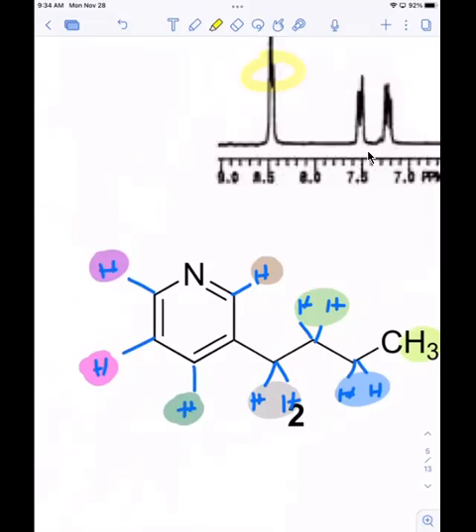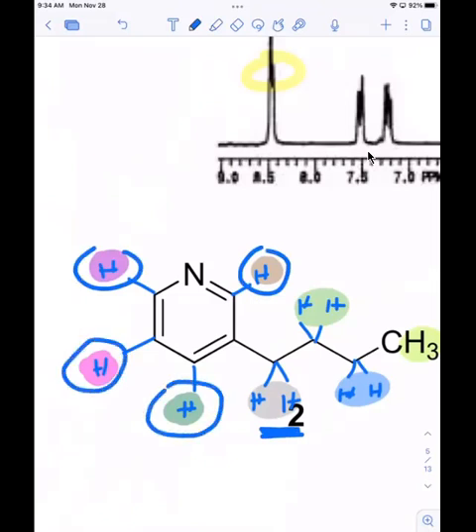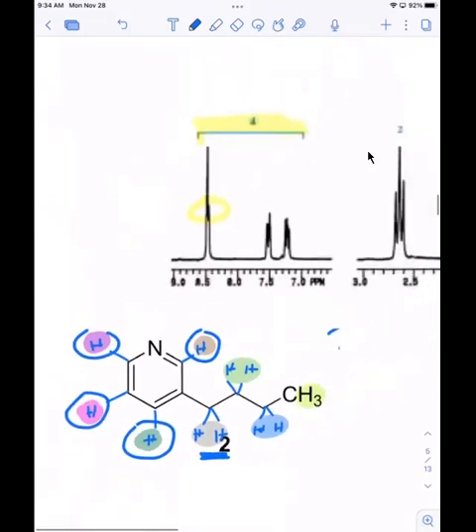You mean right here? Yes, they count, but they're not aromatic. Do you understand what I'm saying? The aromatic protons are the ones directly attached to that aromatic ring. So that's why that set of signals integrates for a total of 4 protons. You follow what I'm saying?